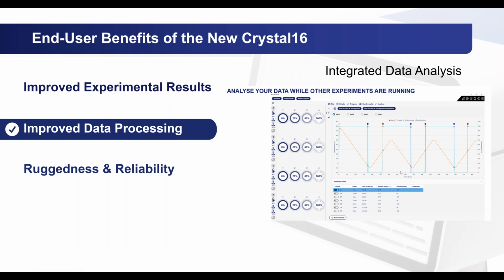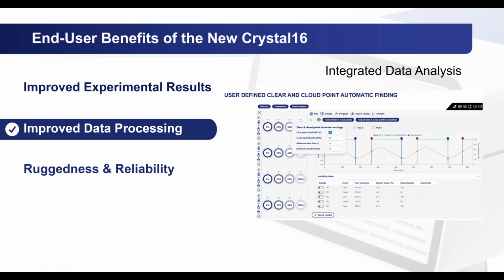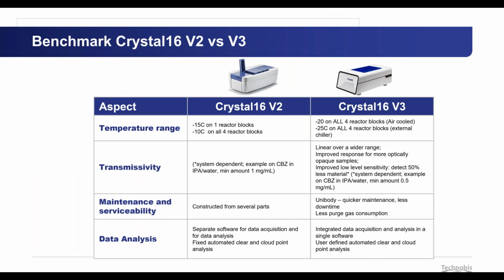And of course, there are different ways. You also have a very automatic way, so you do not have to look yourself for the points, and you can optimize it. So that's also the beauty of it, that it really makes your life much easier. And besides all the features, it helps to export the graph in a certain format with the colors that I want, with the thickness of the lines, of the data points that I would like to include in my presentation. So quite a lot of flexibility.